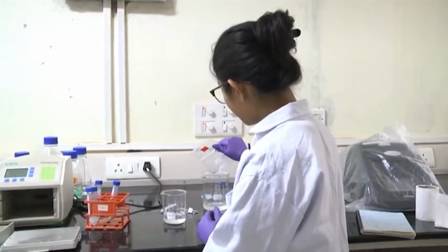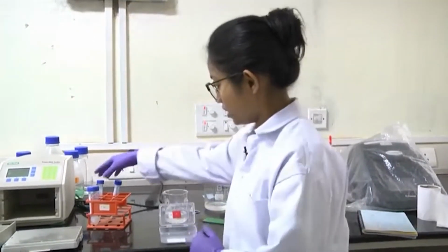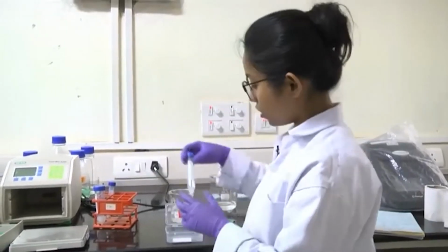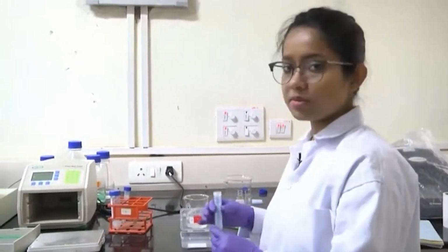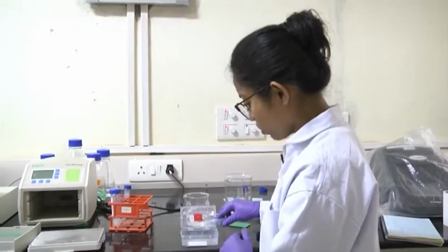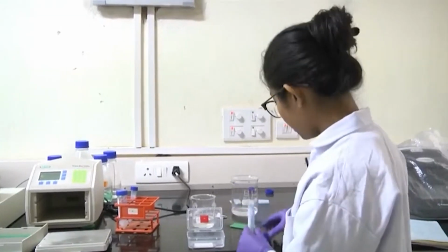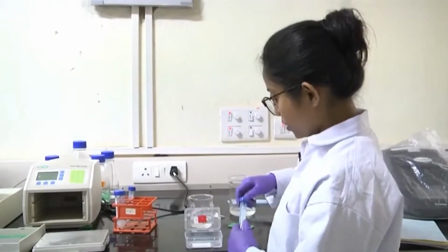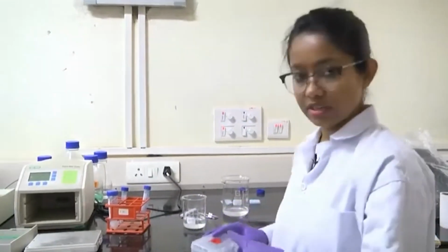Now I will remove the buffer, and next I will put the secondary antibody. Now the secondary antibody is also dissolved in the TBST buffer, and since secondary antibodies are very much specific to the primary antibody, you will need only a small amount. So 1:25,000 or so. The secondary antibody, we will keep it for suppose 1 to 2 hours, again in the rocking condition.